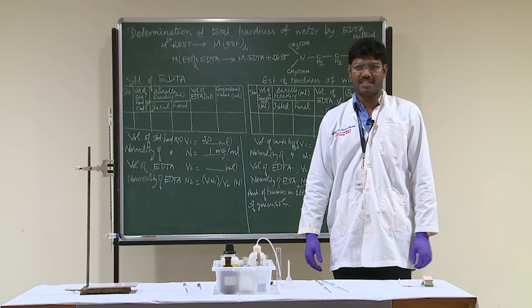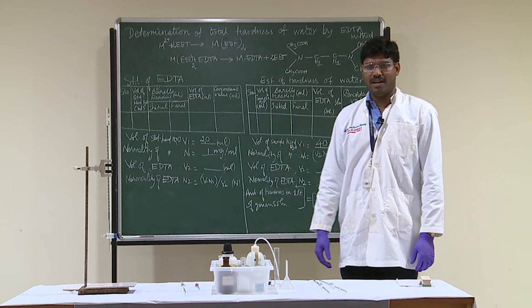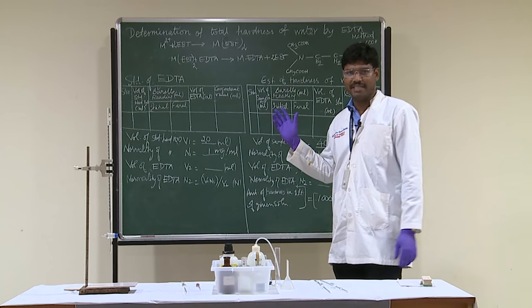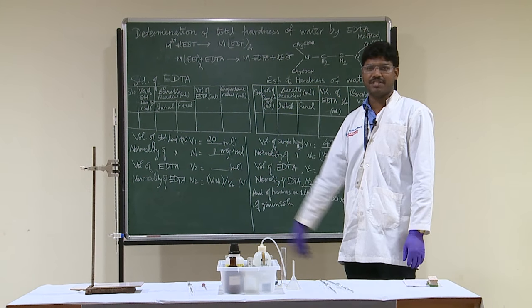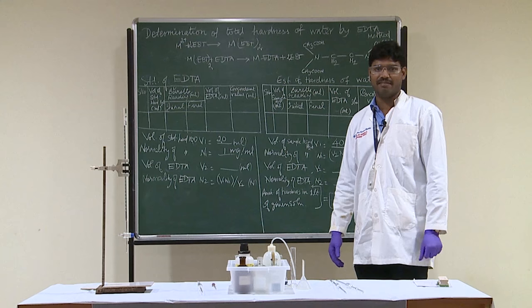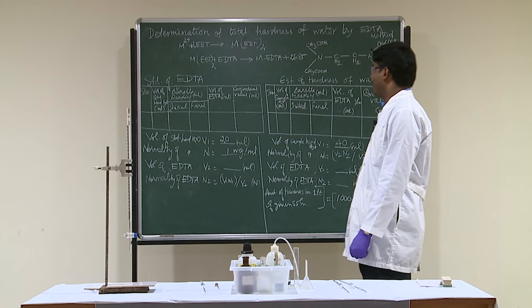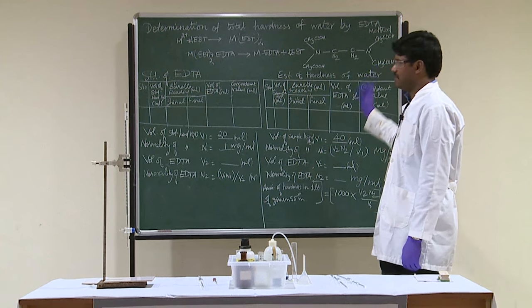Hello, I am G. Sakthivel. Here I am going to demonstrate the determination of total hardness in water using the EDTA method.